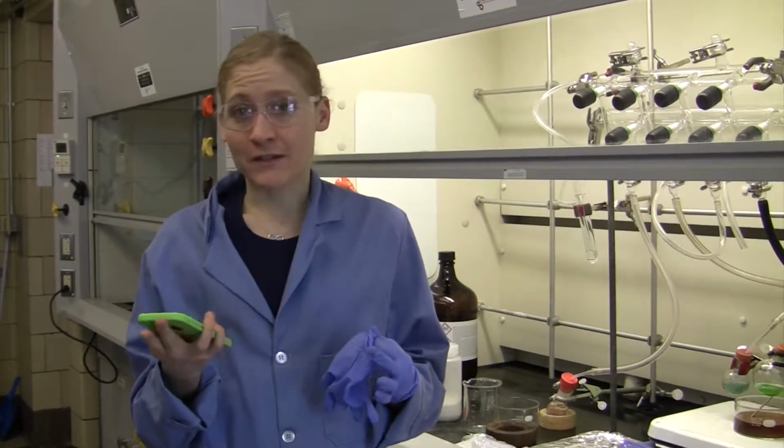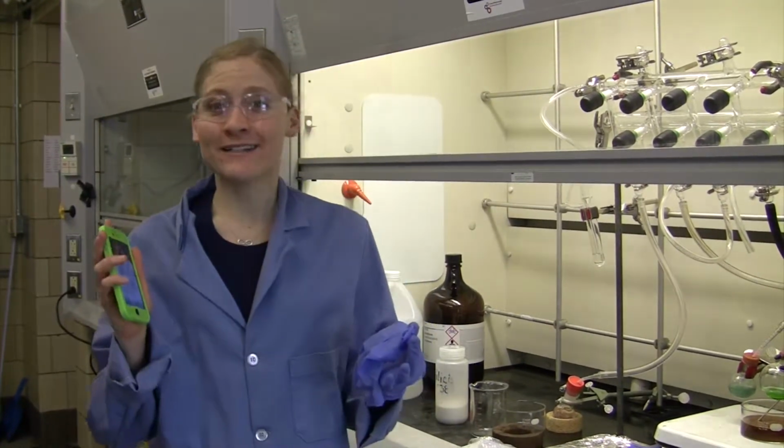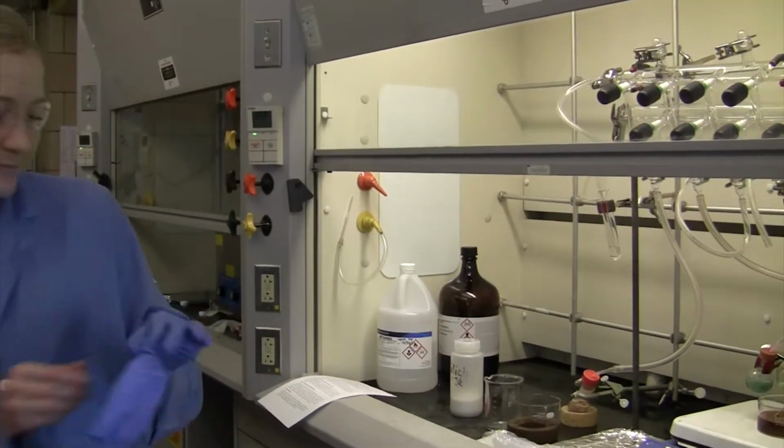We'll have our cell phones in the lab. That's pretty much to be expected these days. It's a good timer, it's a lot of things, but it's not a good thing to touch with gloves. So take off your gloves when you need to answer your cell phone. Okay.